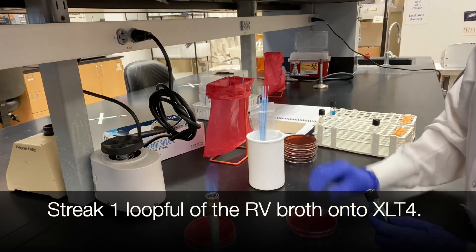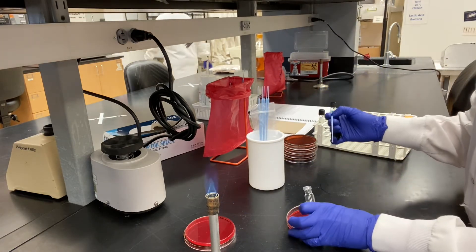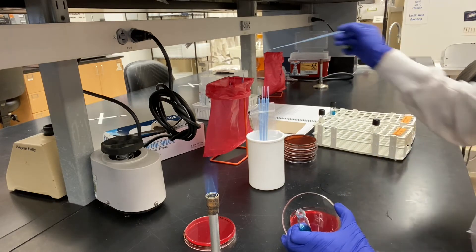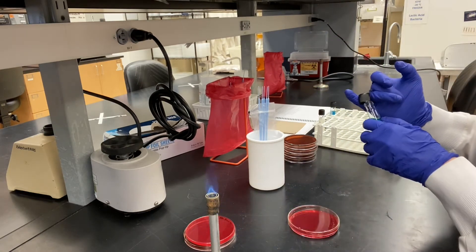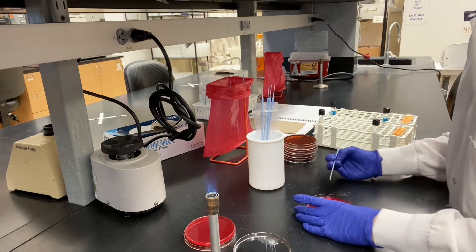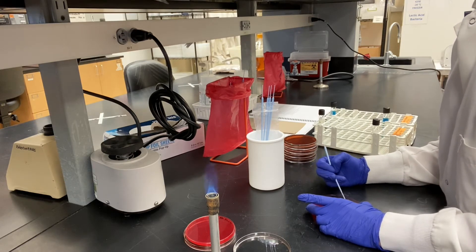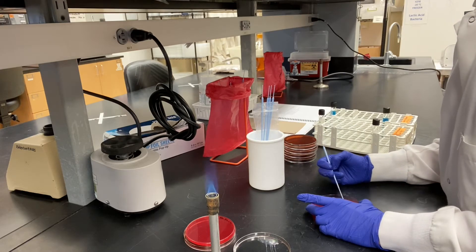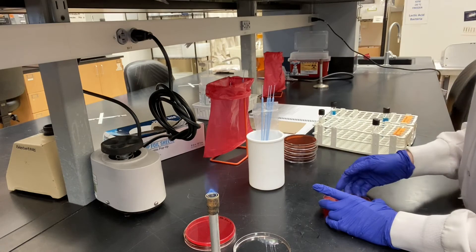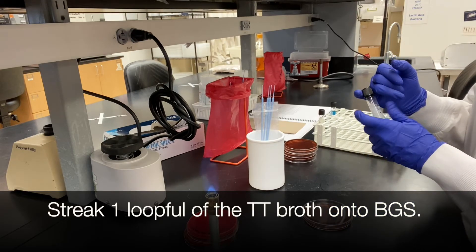Streak one loopful of the RV broth onto XLT4. Streak one loopful of the tetrathionate broth onto BGS agar.